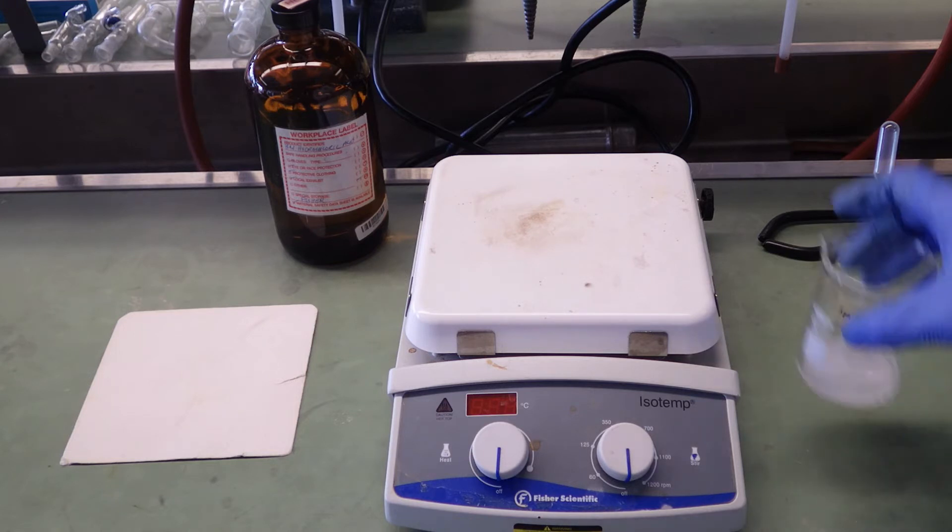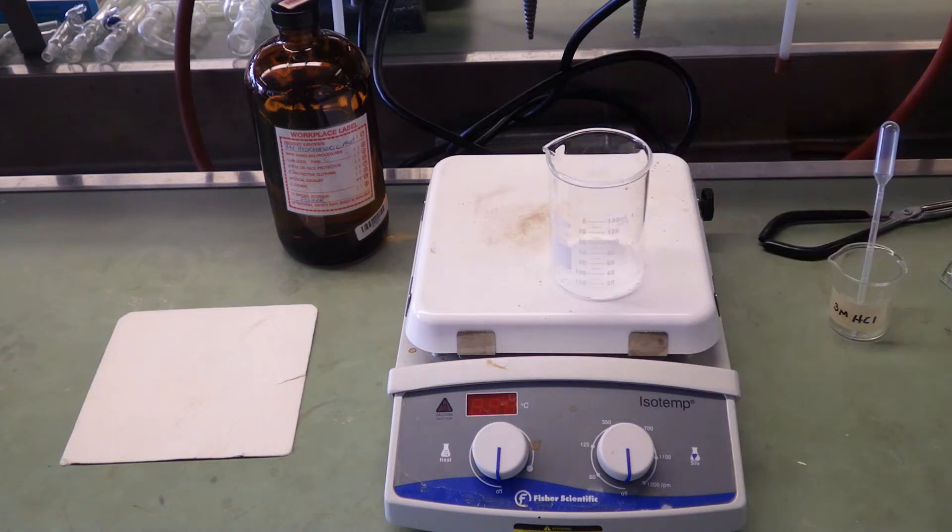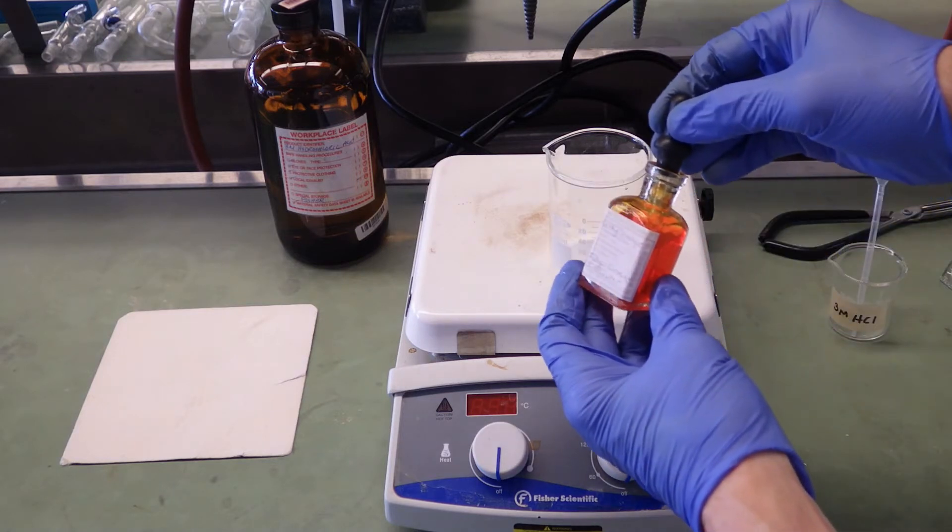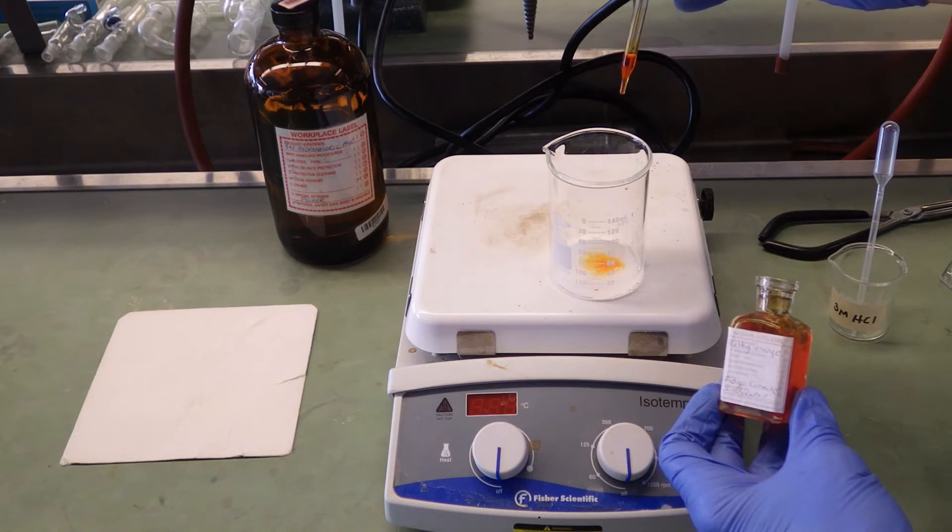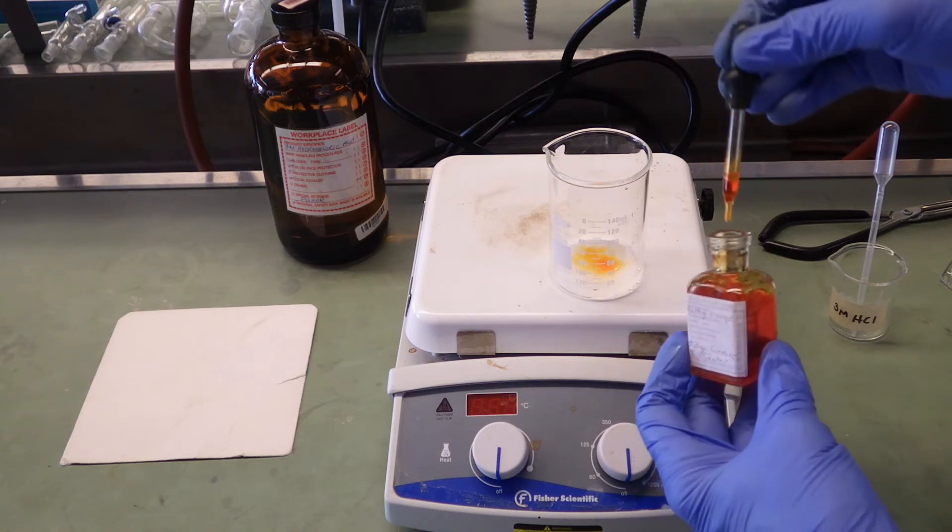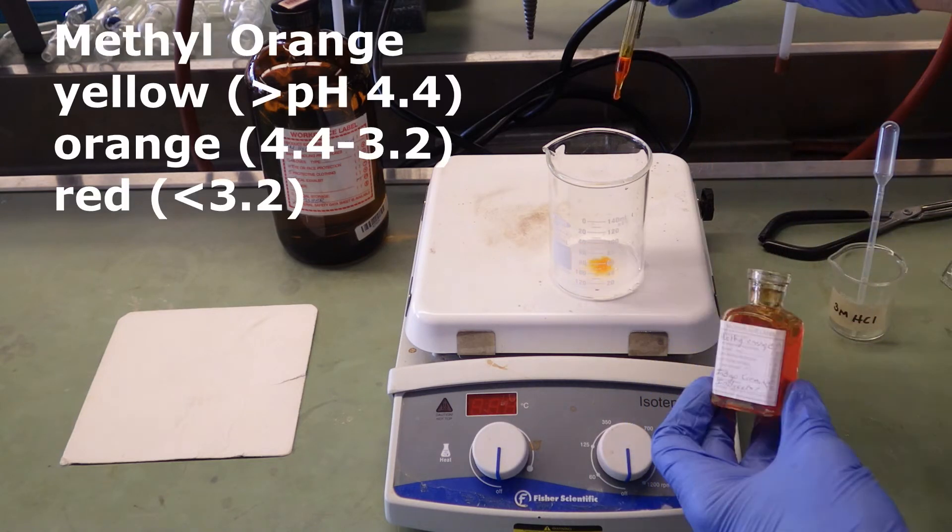Next, I'm adding a pH indicator. Methyl orange. Methyl orange is yellow at a pH greater than 4.4. It's orange between 4.4 and 3.2. And it's red when the pH is less than 3.2.